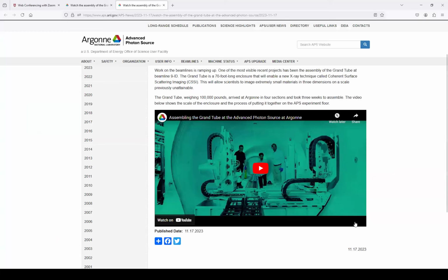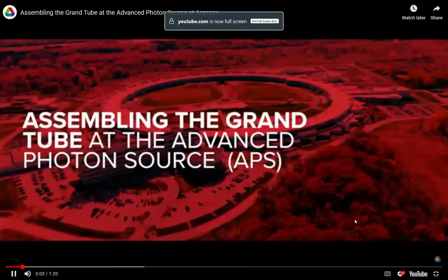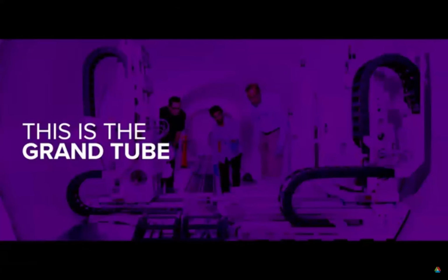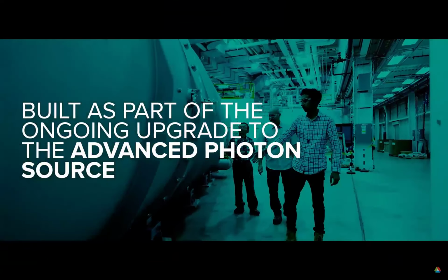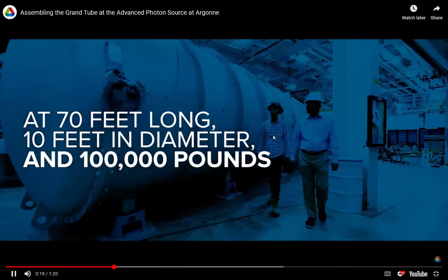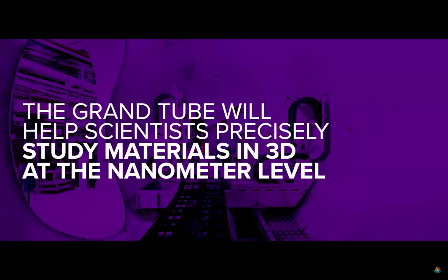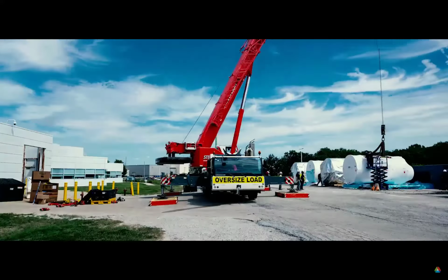I wanted to show you a video that'll give you a sense of the scale. There's some PR from Argonne about our grand tube. This, I think, gives you a better sense of the scale of the project. Yeah, it's a big guy. And as you can see, it's not contained within a hutch on the experimental floor. It doubles as its own radiation enclosure. That also is something that limits the high end of the energy to 25 keV.